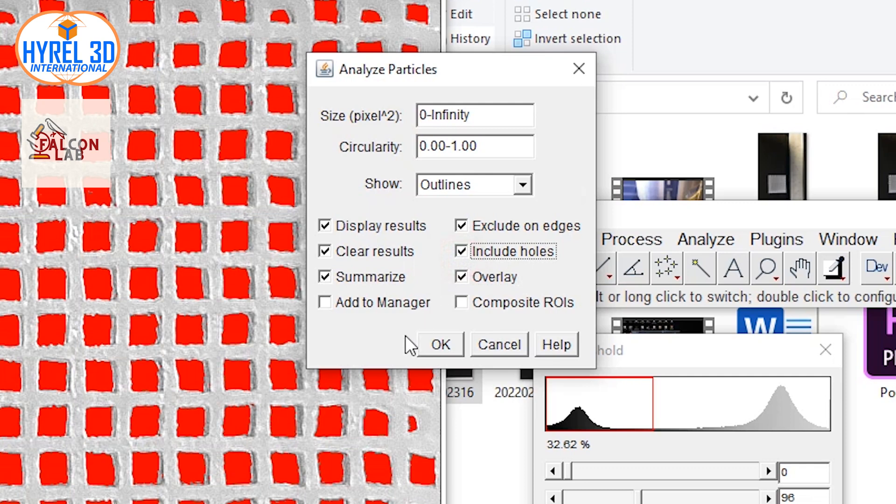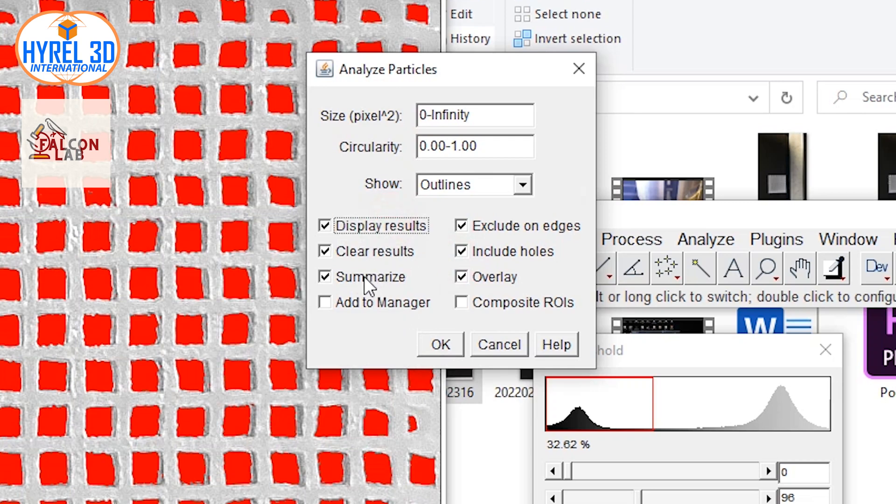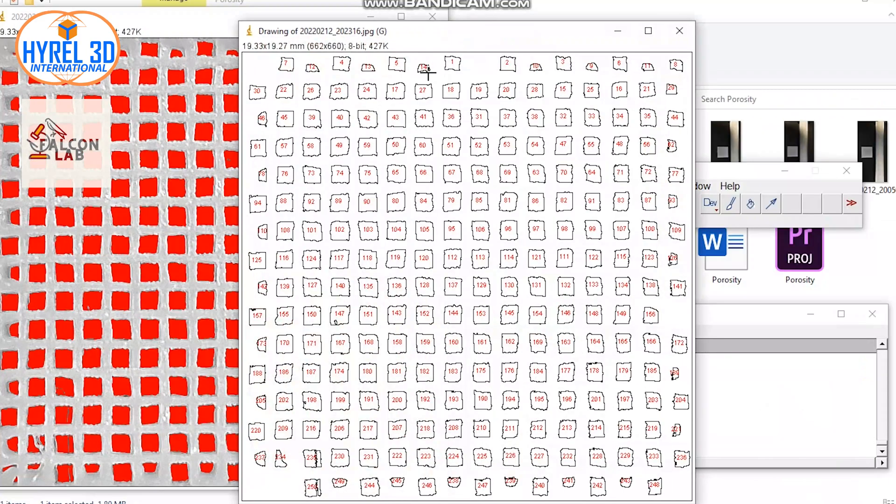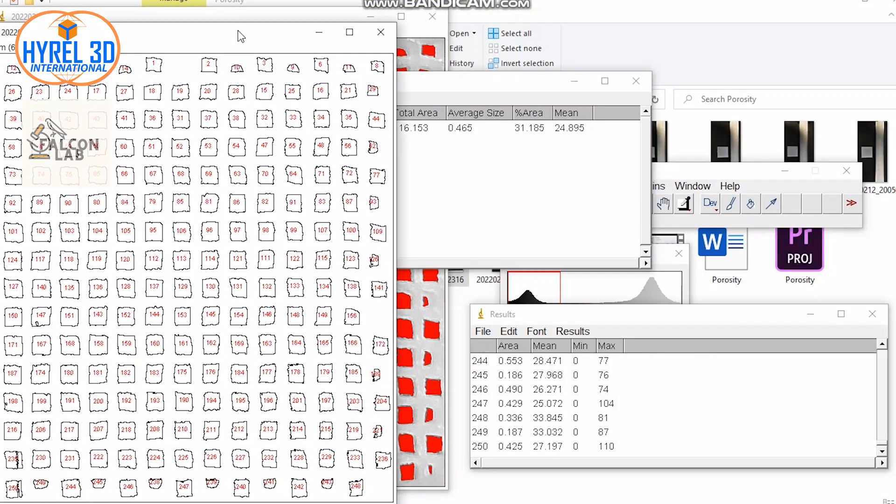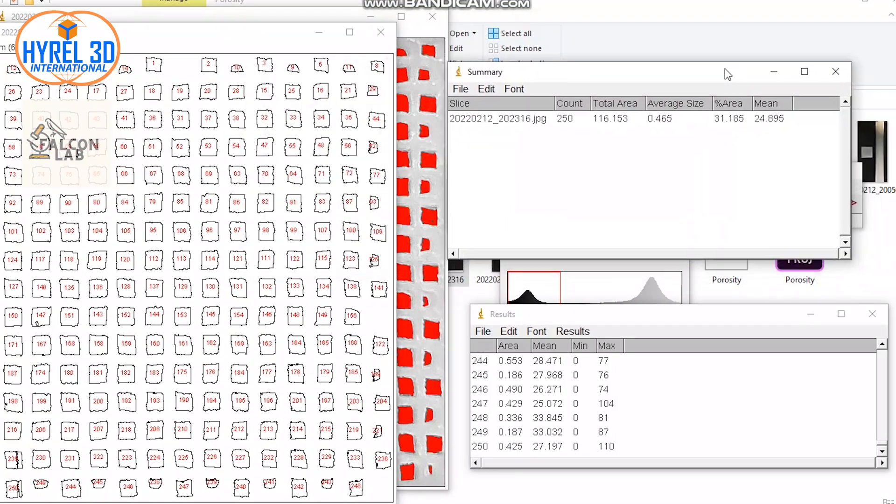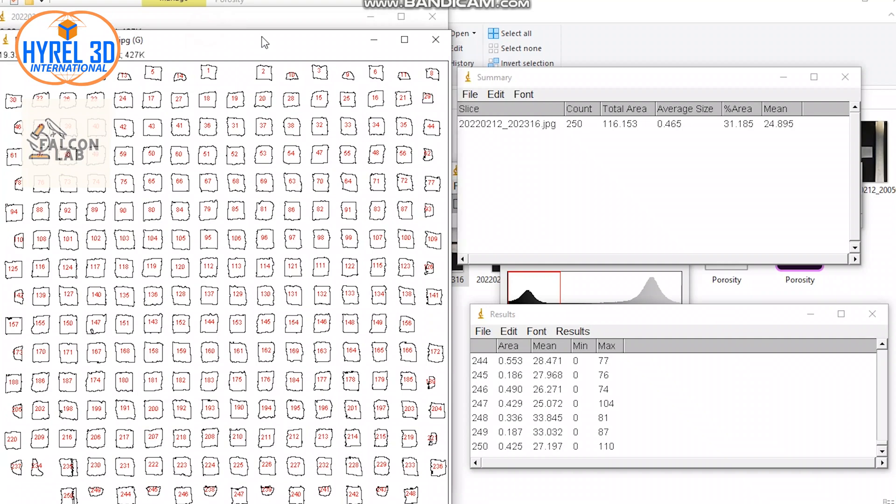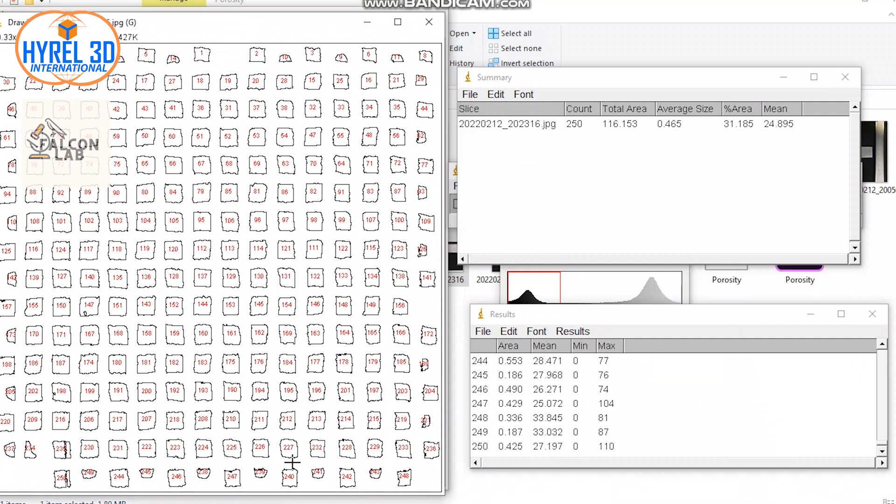Make sure to turn on Display Results so you can see the results immediately. Press OK. Now you will have three new windows. The first one is the outline to show your pores' location.